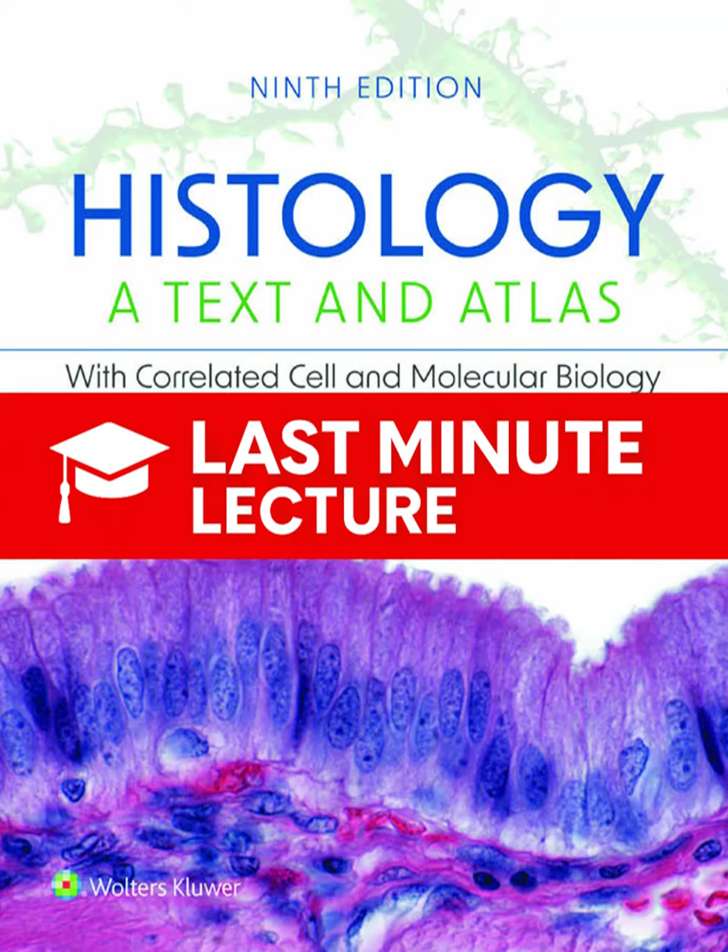Okay, finally in this section, we have this phenomenon of metachromasia. This sounds like the dye is literally changing color. It is. It's a chemical color shift. Metachromasia happens when certain basic dyes, like toluidine blue, encounter a tissue with a very, very high concentration of polyanions. So a lot of negative charges packed really close together. Think of the sulfate and phosphate groups in cartilage matrix, or inside the granules of mast cells. They're packed in there super tightly.